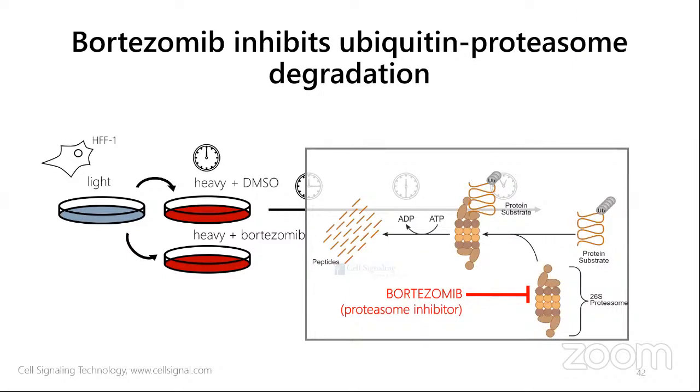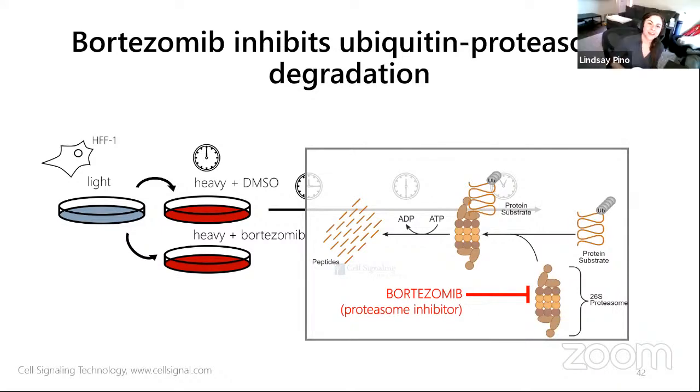But I'm not sure why we, like science as a field, originally picked DMSO to reconstitute these versus something else. Another comment by Raja: I think it's because DMSO can dissolve way more things than you could in just an aqueous solution. There's definitely the argument that using water is only going to get water soluble things, and some drugs are not easily water soluble.